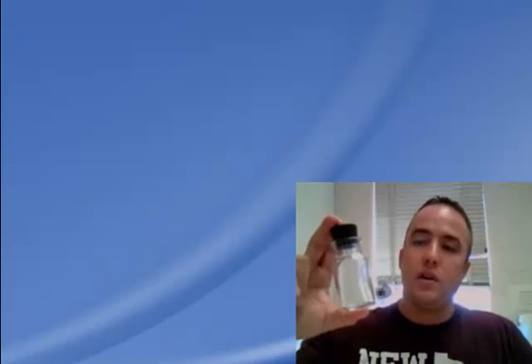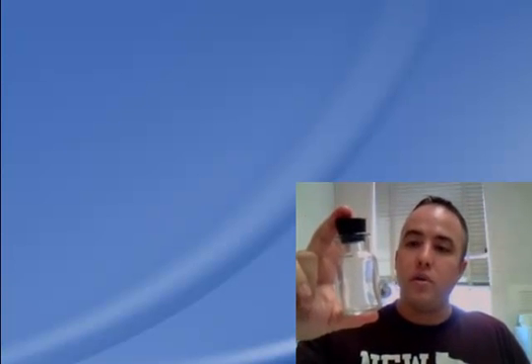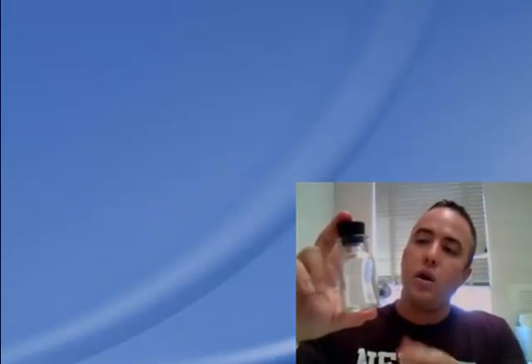Then we're going to fill it with water. We'll fill it all the way to the top. We'll turn our stopper in such a way that whenever it pushes in, it's going to force all of the air out, and we're going to make sure that there are no bubbles in it. Bubbles will have a volume of their own, so if there are bubbles caught inside, they're going to disrupt the volume of the jar itself. They'll take up space and you won't get accurate data from that point on. So make sure there's no bubbles in it.